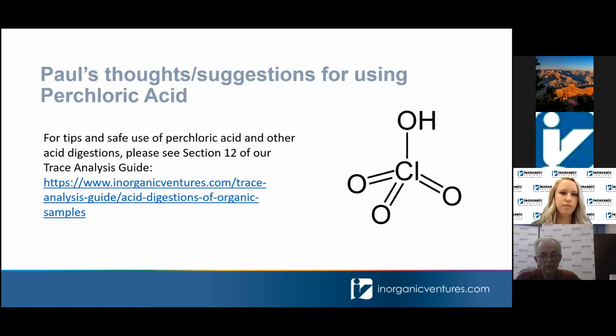I've seen the fronts of ICPs engulfed in flames when an alcohol solvent, such as isopropanol or ethanol, is mixed with enough nitric acid. The explosion hazard is one too, where you can form nitroglycerin. Another functionality we want to be careful about is aromaticity. You can nitrate those compounds and form things like TNT.